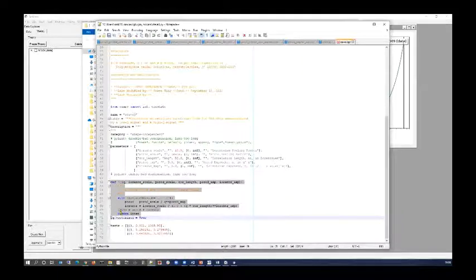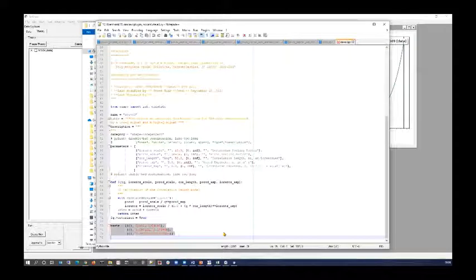So you can see what's being returned is this variable I of Q for intensity, which is a sum of those two bits, Porod and Lorentz. And there's the definition of Porod and Lorentz. So this is a fairly simple example. You don't need to know too much about programming to figure out what's going on in here, okay? And the bit at the bottom here is basically a collection of Q values and calculated intensities, which, if you specify them, then when SasView loads the plugin, it runs the test just to check things are going to work, which is quite nice.